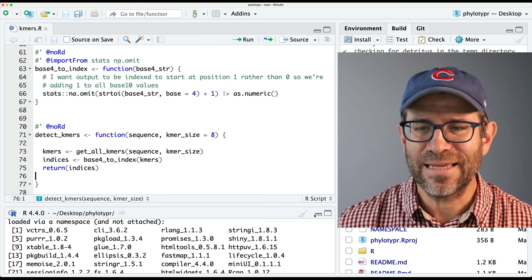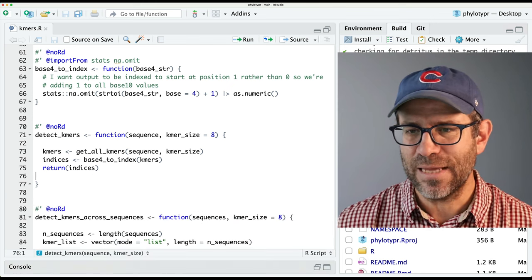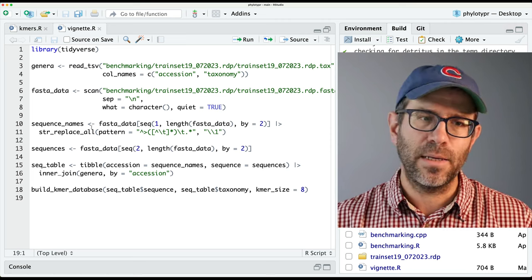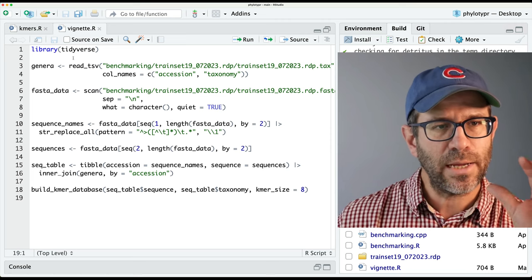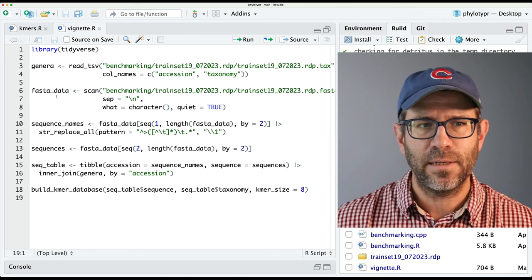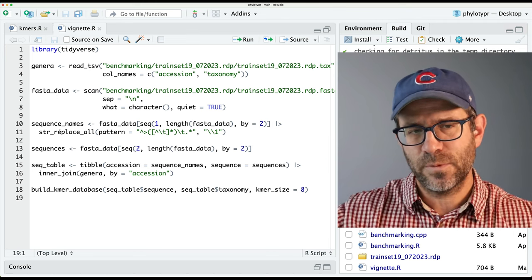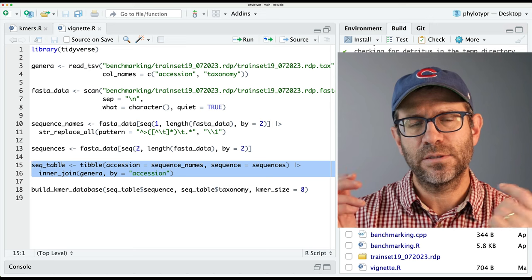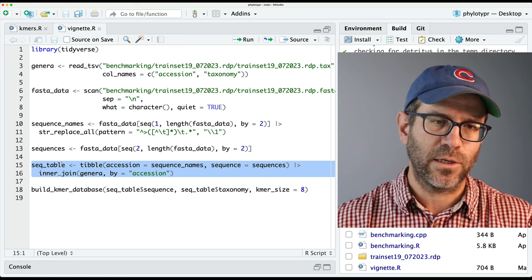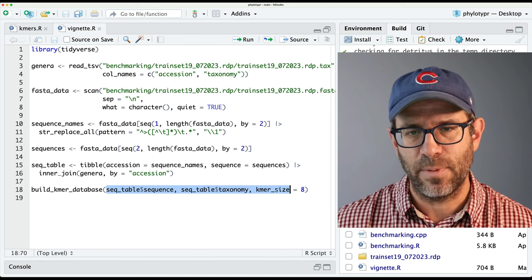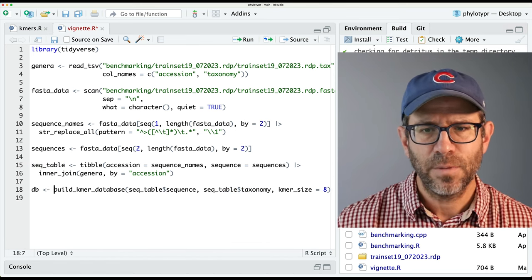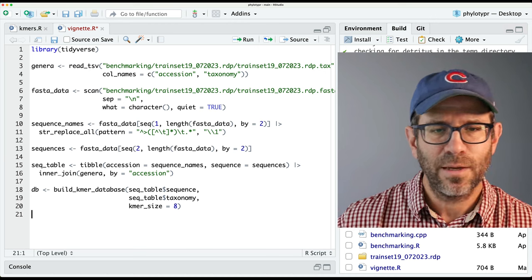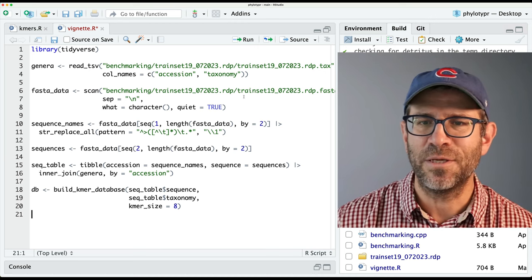Now we're ready to get on with the business of today. I'm going to go to my benchmarking directory and open up vignette.R — this is kind of my working document for how I might interact with these tools. As you can see, we're getting the taxonomic data and sequence data, parsing apart the names as well as the sequences in lines 10 through 13. Then we join together the sequence data and taxonomy data to make sure the information is in the correct order, and then we pass that to kmr_database. I could imagine calling this like DB, maybe putting these arguments on separate lines.